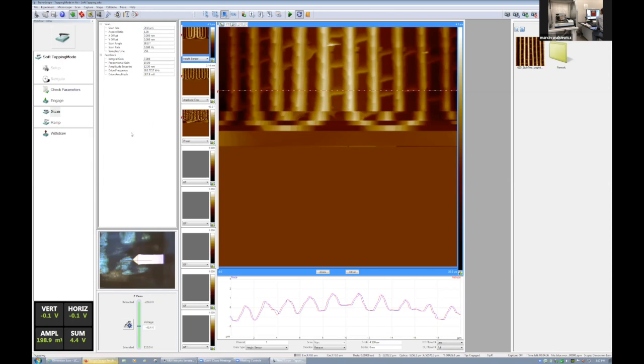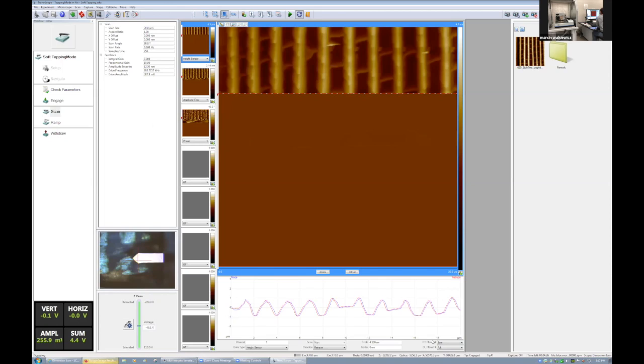One thing I wanted to mention is that the advantage of the AFM is really just force. With the electron microscope, what Ryan was alluding to is that if you bombard a non-conductive sample, it will charge up, kind of like when you get static cling or a static shock. That just means you've been charged up with too many electrons, and under the microscope it will look weird because there's a cloud of electrons stuck on the surface of the sample. With AFM, you don't have that. You can just feel the sample.